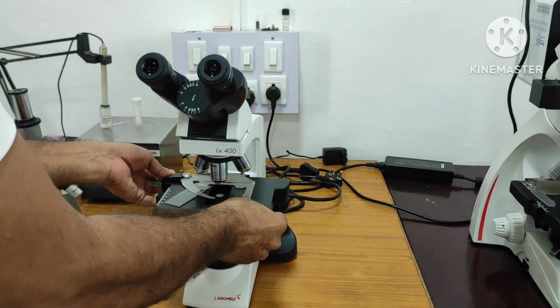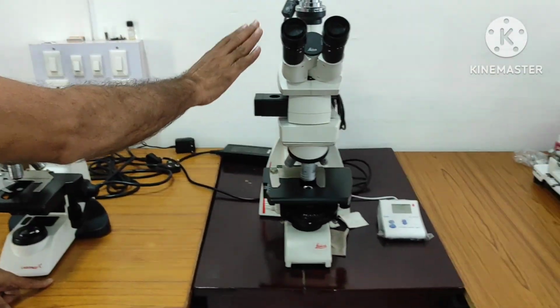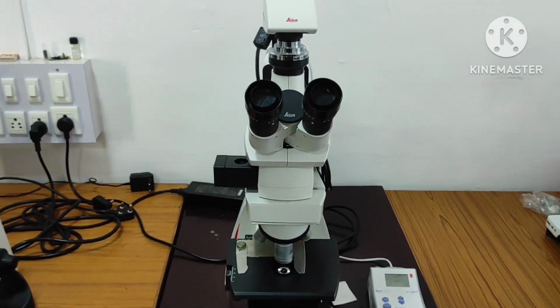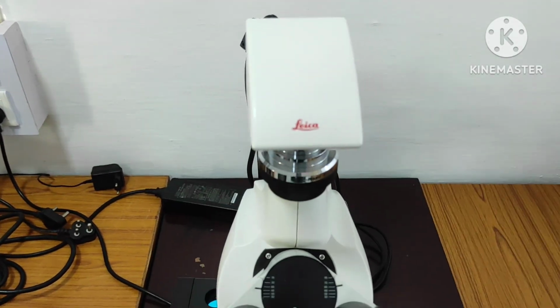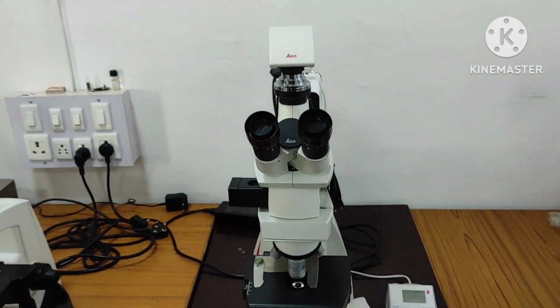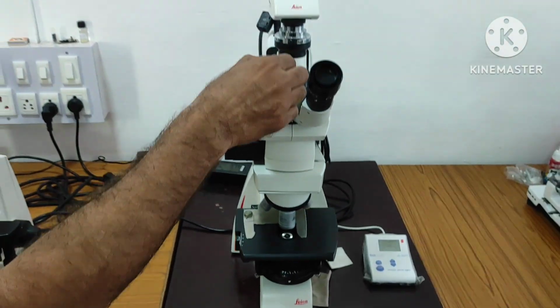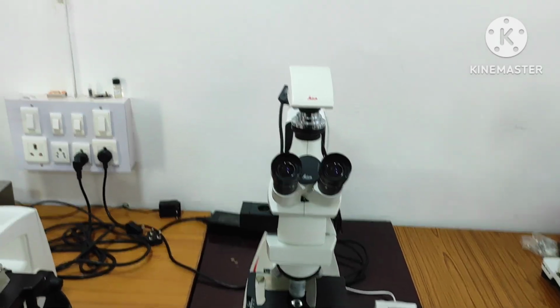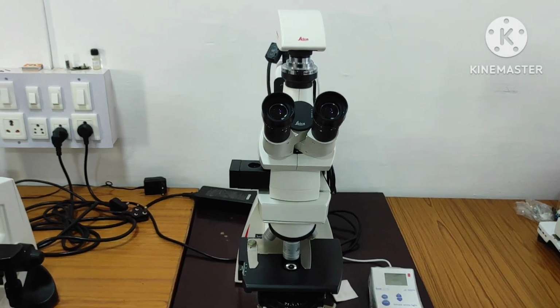So friends, a little bit more sophisticated instrument in this series, that is also a type of compound microscope only, right? We have been using this for the last 4 years, and the brand is a very good brand, right? It's German make, and costly instruments, so highly sophisticated things are present, so we have to use it carefully. But we are getting fantastic results, right? Cells, nucleus, even chromosomes we can observe here, and we use this microscope on a daily routine basis.